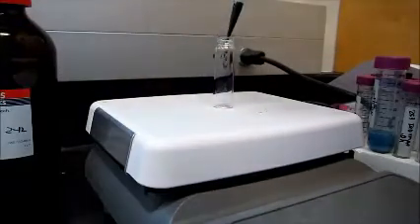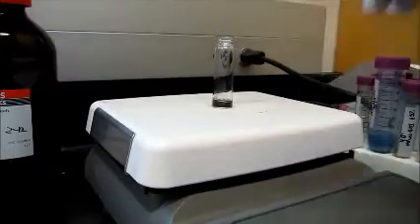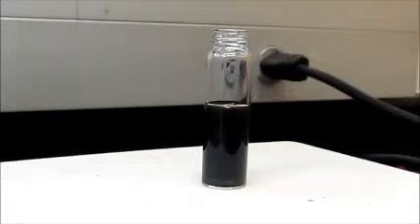First, we will add 500 microliters of iron oxide and then begin stirring. Next, we will add 3 milliliters of 5% PVP, followed by 1 milliliter of 1% sodium hydrosulfide. This reaction will stir for 20 minutes.